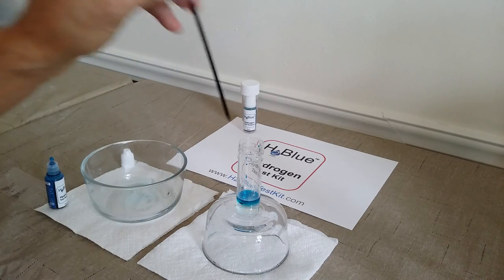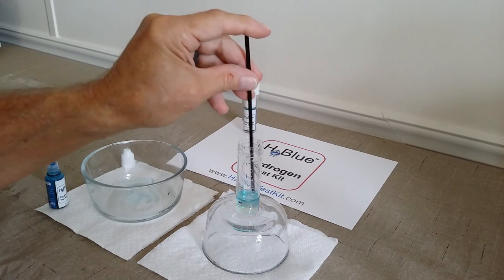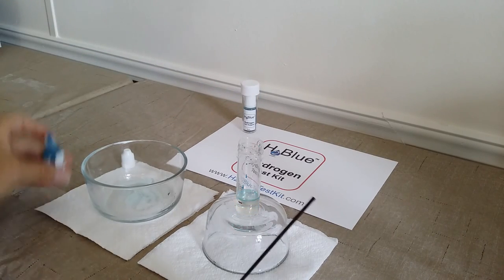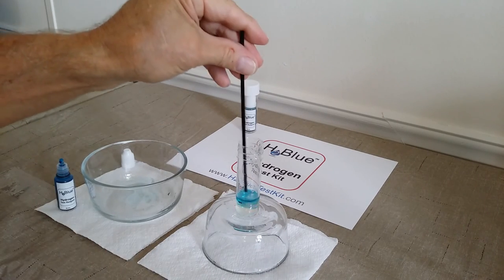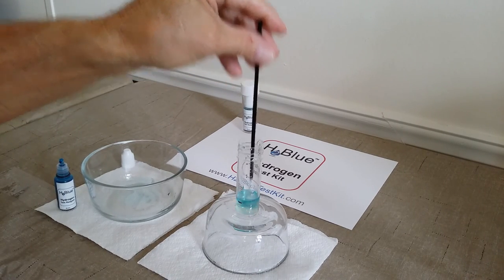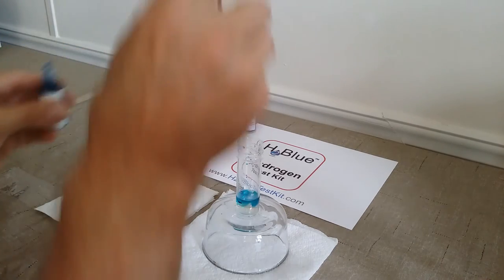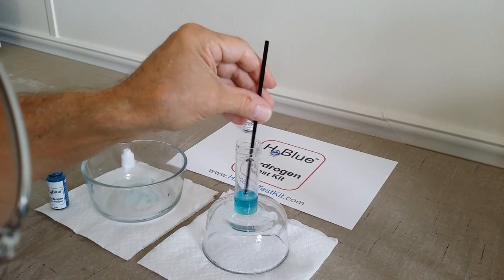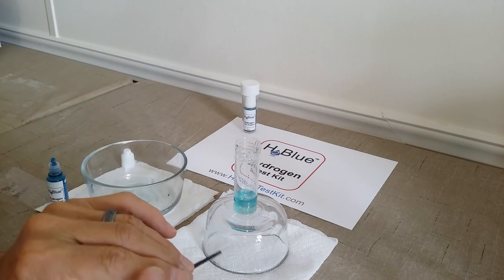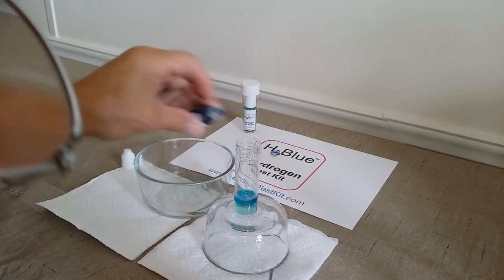You don't want to shake this beaker. And at 12 drops, you can see it still turns clear. Let's go 13. Still turning clear. 14. But it's getting close. It's slowing down. I'm going to add one more drop.